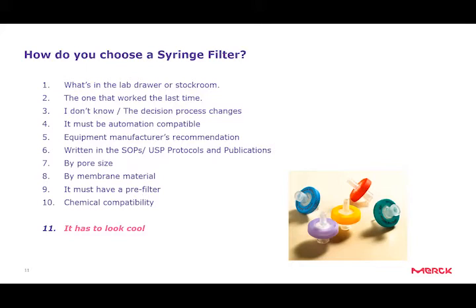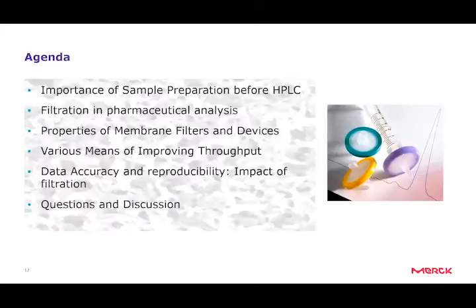Now in the next few slides, we are going to go over some of the key membrane filter characteristics as well as the device characteristics.